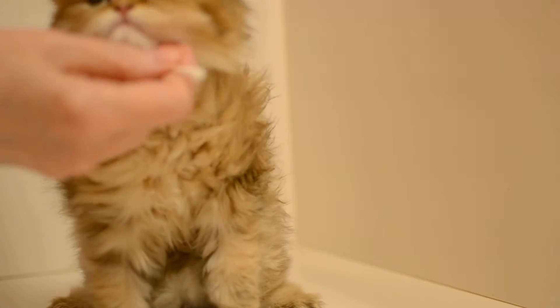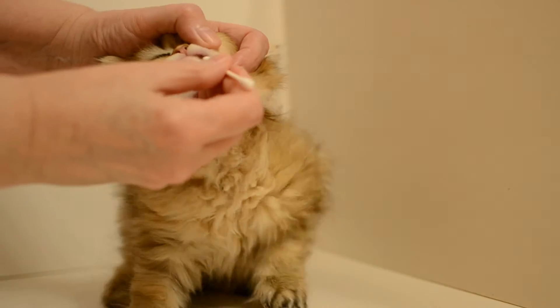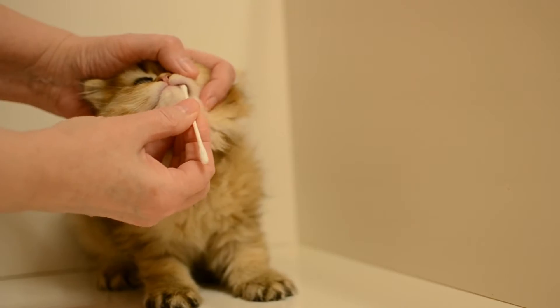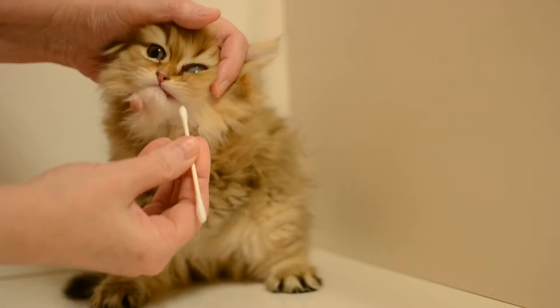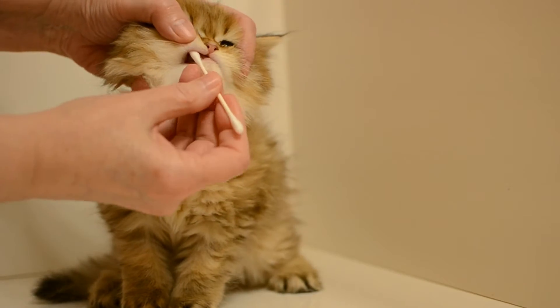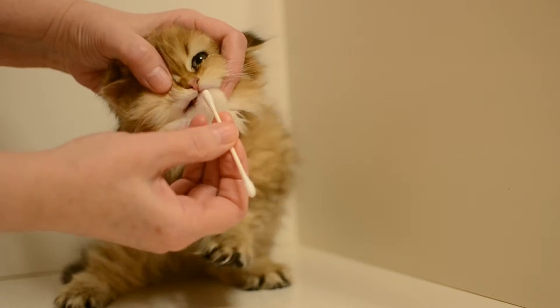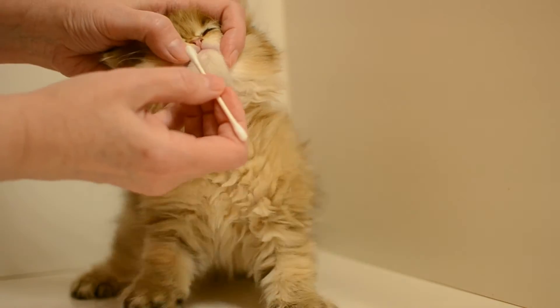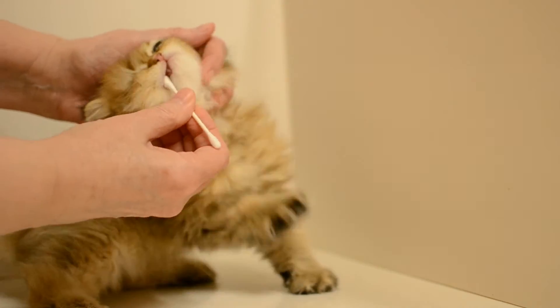Today we're taking a DNA sample of this little Persian kitten and we're using a cotton swab on the inside of his cheek. I know you don't like that — it doesn't hurt, but I'm sure it feels funny because his cheek is so small. We do a little bit more, and what we do is a total of four swabs.